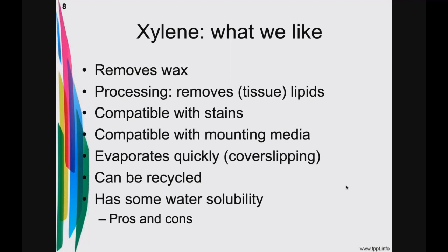Environmentally, sure would be nice if it was recycled. That keeps your bills down, that you can recycle it. And believe it or not, xylene does have some water solubility. All right, we'll talk about that very shortly. That water solubility, meaning that xylene can hold small degrees of water, there's pros and cons to that that we're going to be definitely talking about in this next short time period.